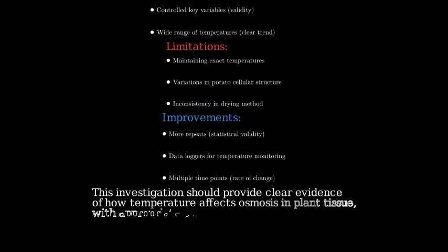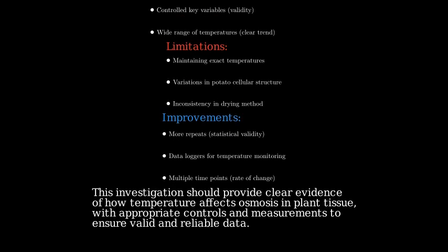In conclusion, this investigation should give us clear evidence of how temperature affects osmosis in plant tissue. The combination of controls, repeats, and appropriate measurements ensures we collect valid and reliable data to test our hypothesis.